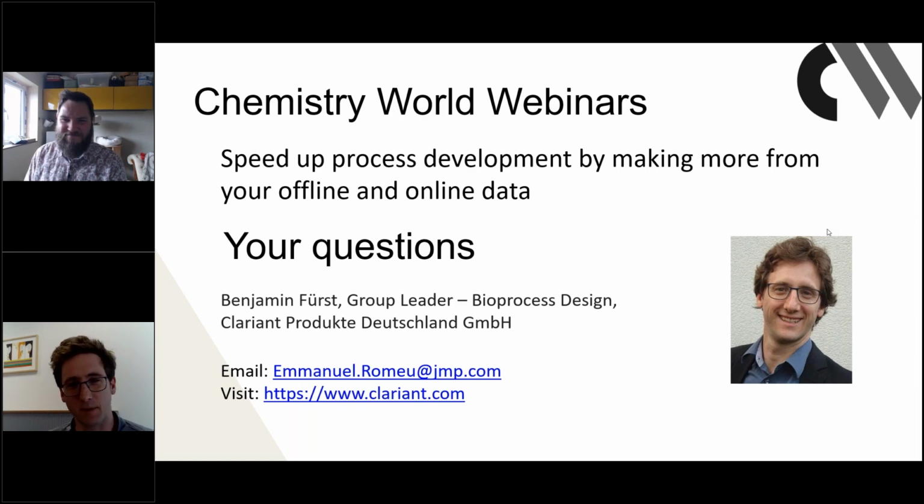So data preparation depends where you stand. Do you have a process control system where you can just take your data off, or do you just have a standalone PC somewhere in your lab and you draw the data from that in whatever fancy format it is? So that data preparation can take some real time.